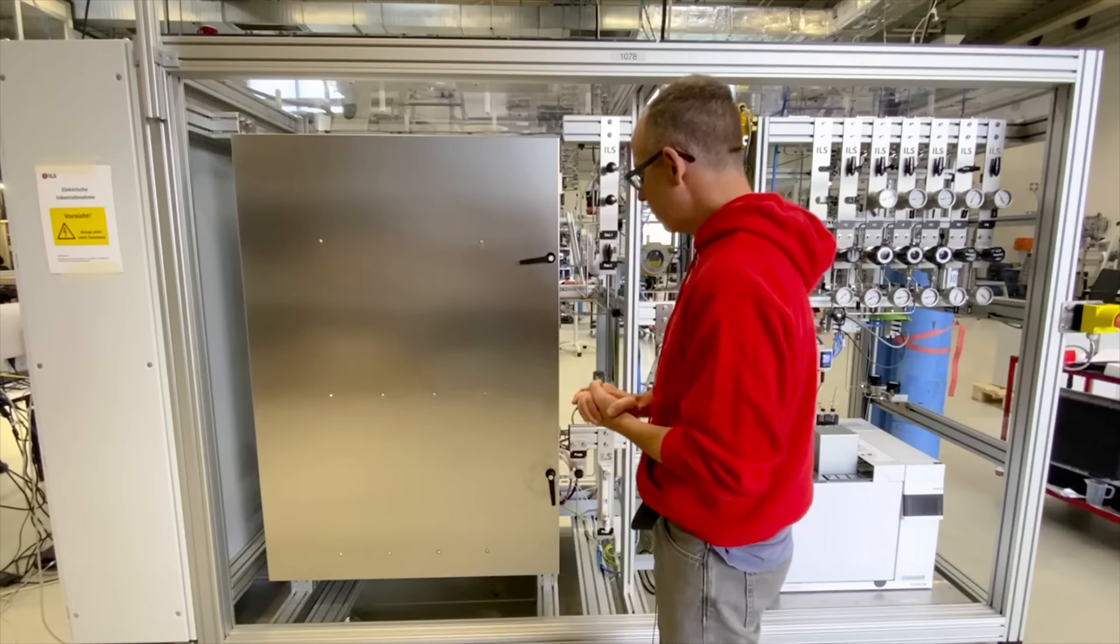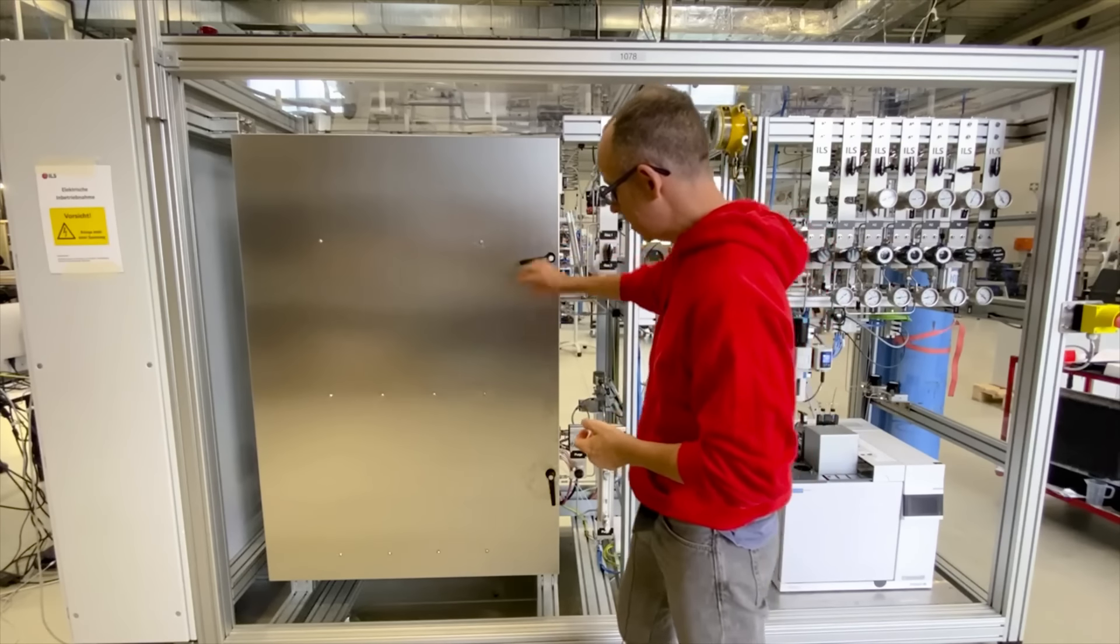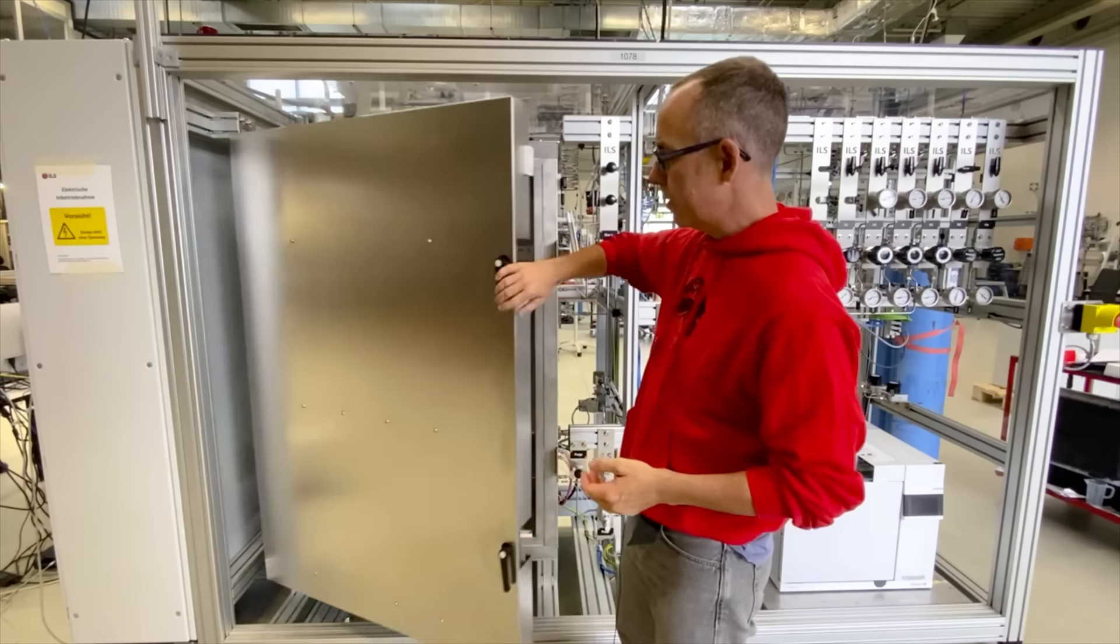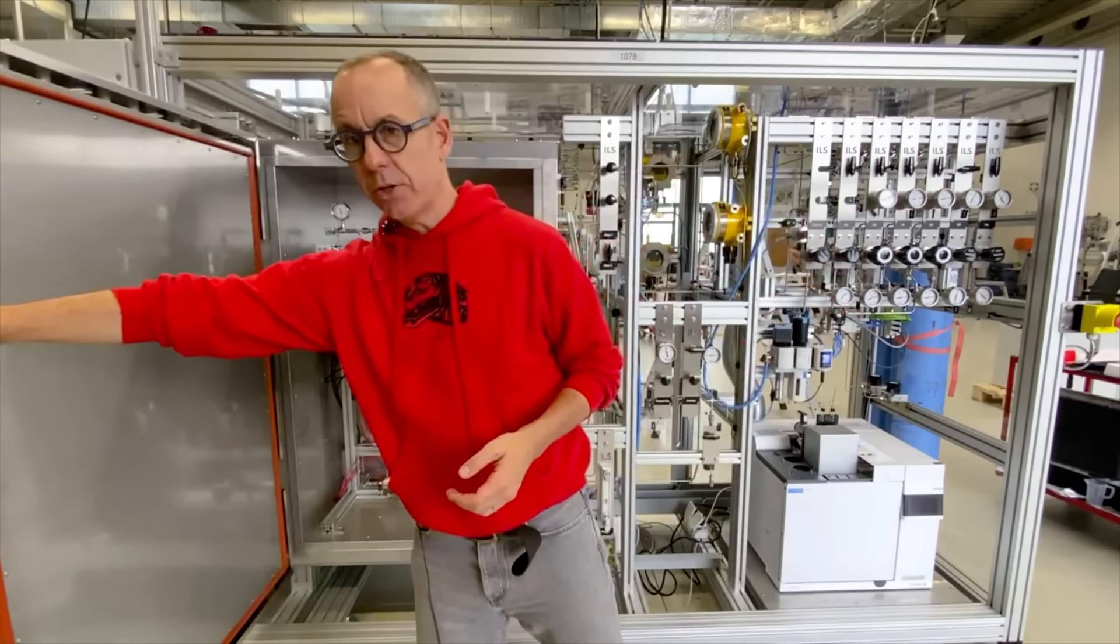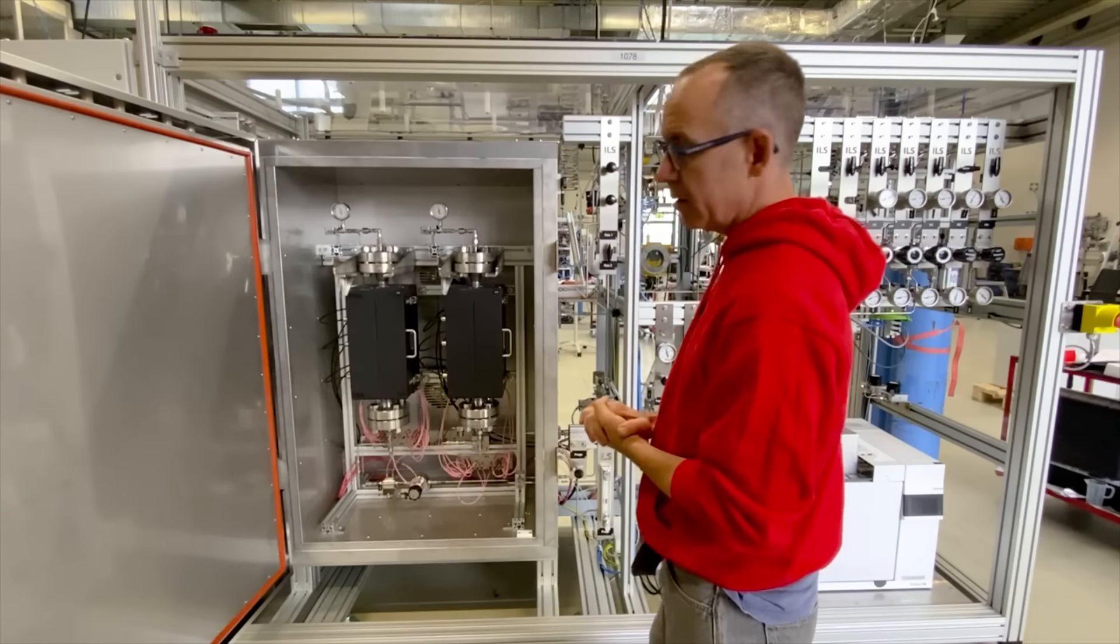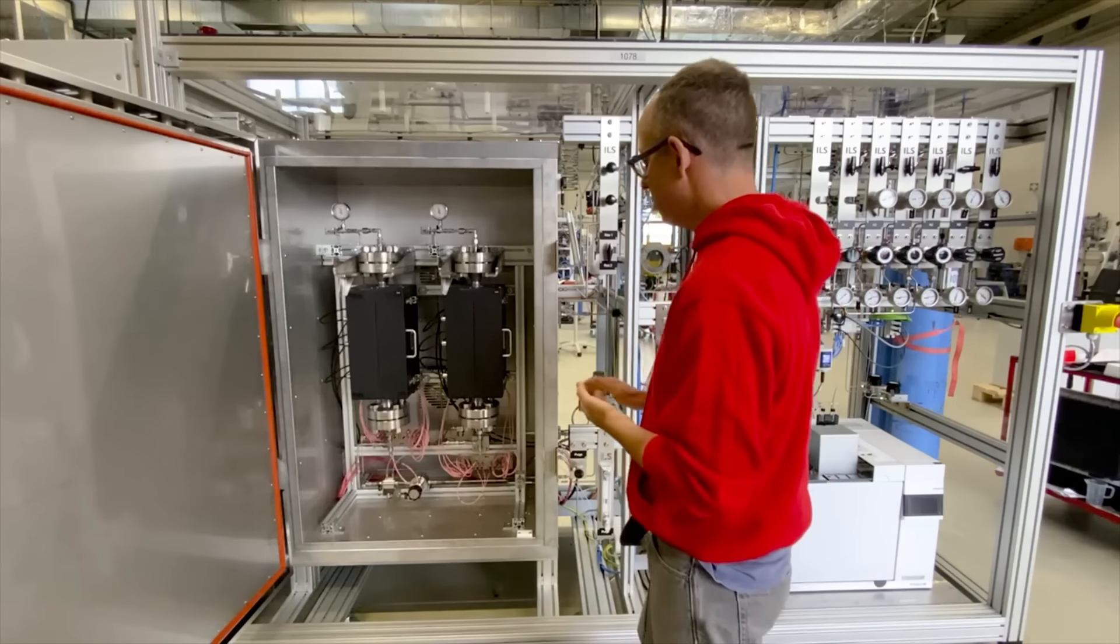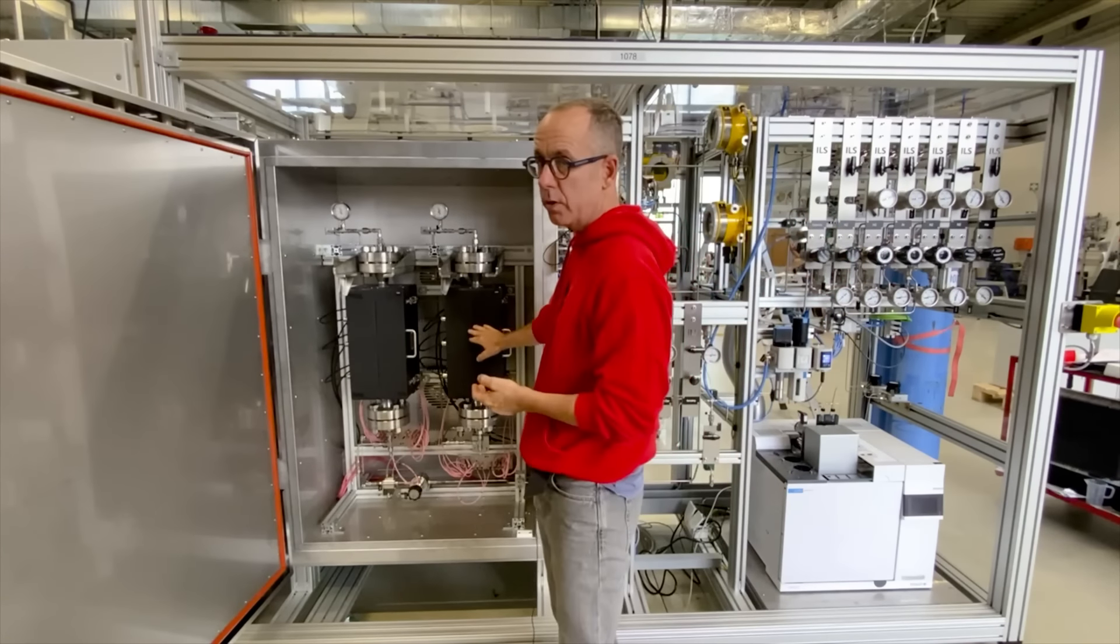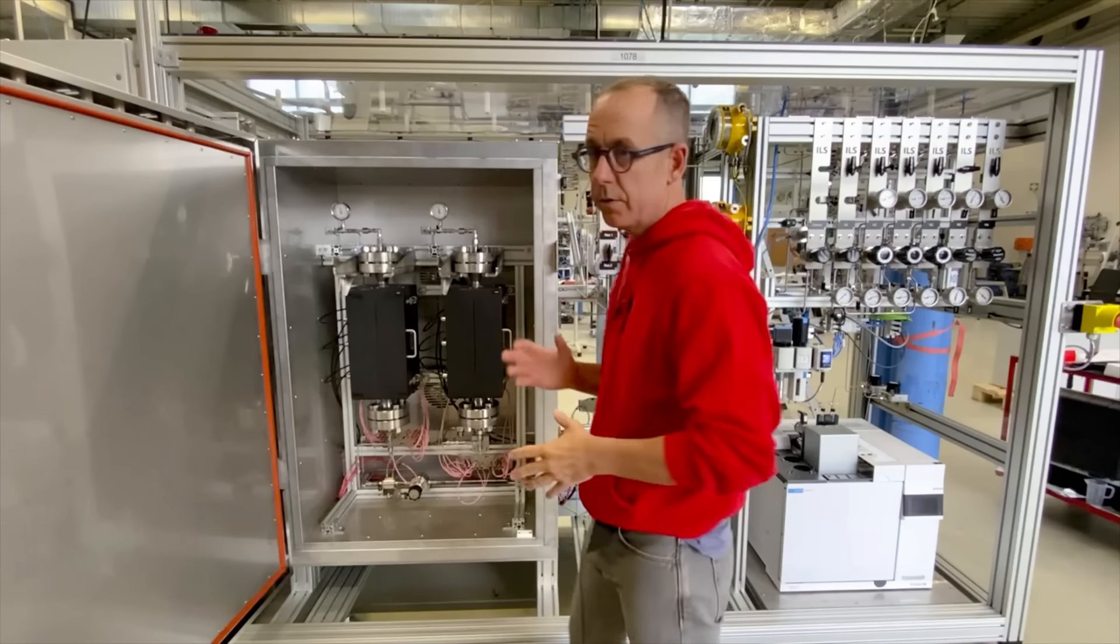This unit was developed specifically for studying ammonia synthesis in fixed bed reactors. We have dual fixed bed reactors here mounted in a large convection oven which is primarily to prevent any condensation of reagents or products. In this case we have multi-zones or three-zone convection ovens here used for each of these reactors.